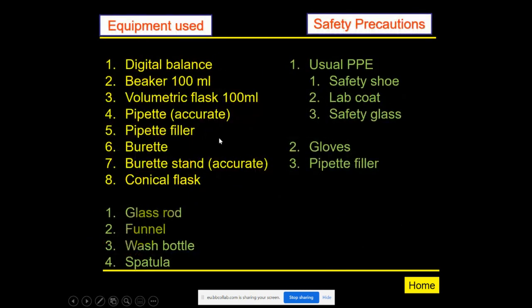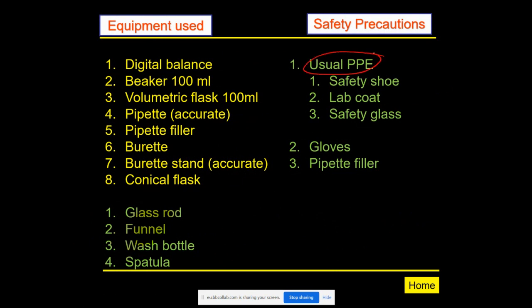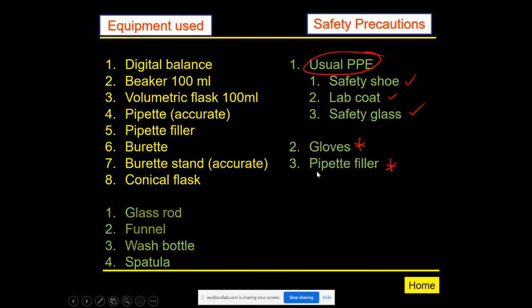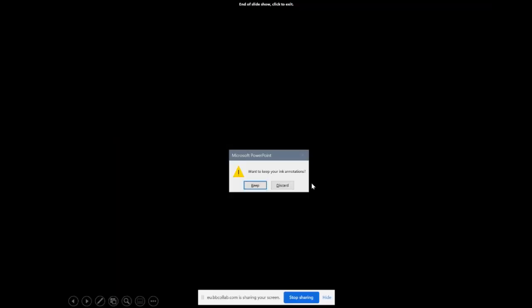These were the equipment used in our practical, including a digital balance, volumetric glassware, and more — refer to the lab manual for their names. For safety, we use normal PPE: safety glasses and gloves to protect our hands when working with acid and base. We also use a pipette filler instead of mouth pipetting for safety.